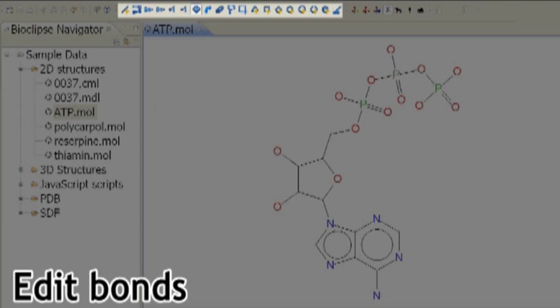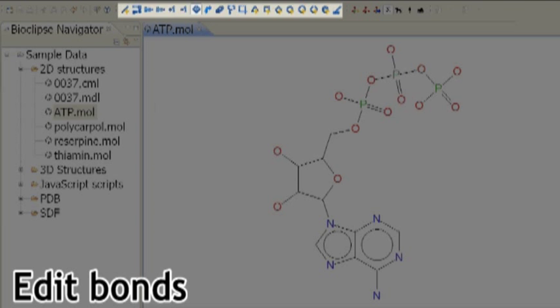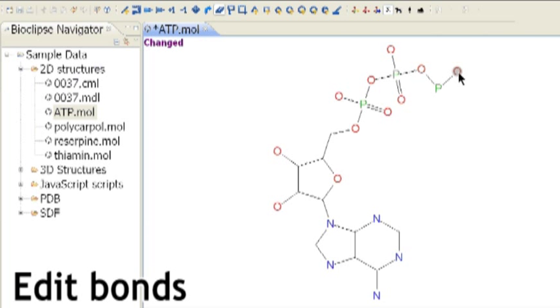From the top toolbar, select the eraser and click to erase the terminal oxygen and phosphorus atoms. Other tools let you add bonds and create new structures.